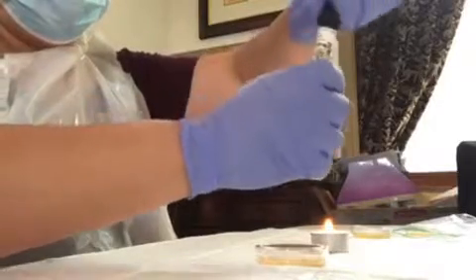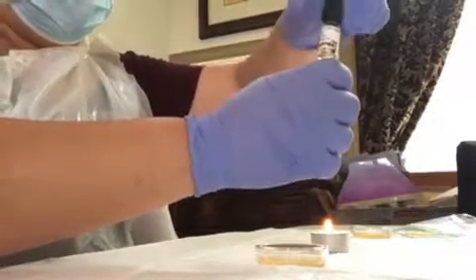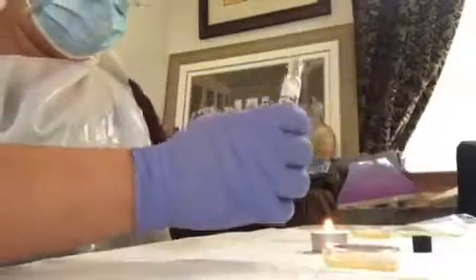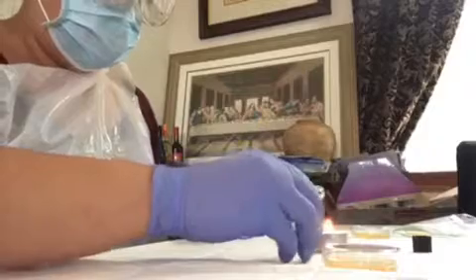First, we have the agar plate. First thing we're going to do is clean the lip.